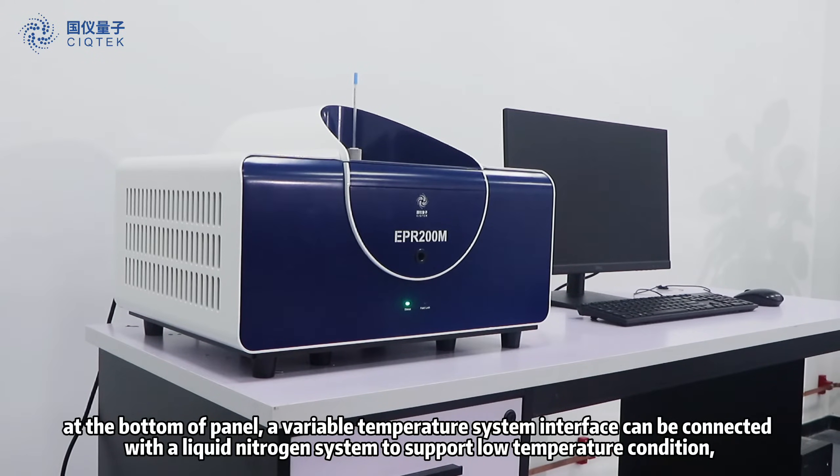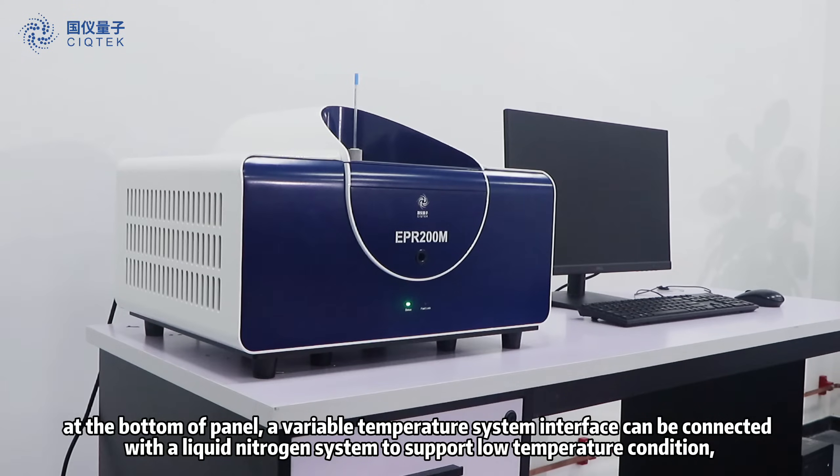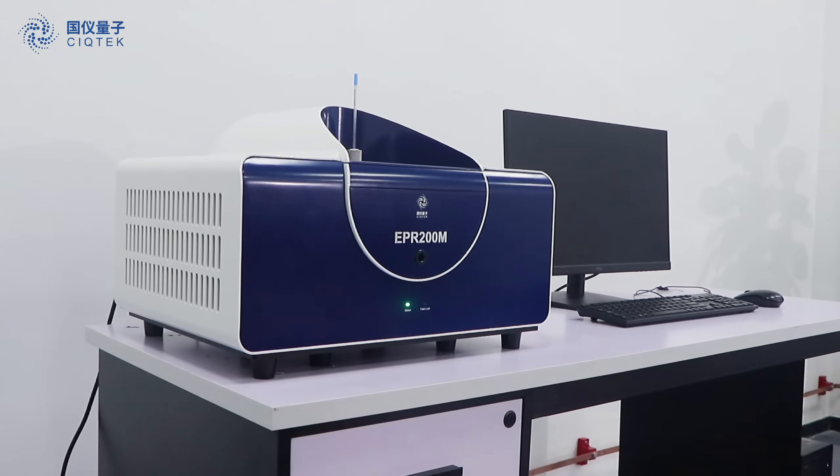At the bottom of the panel, a variable temperature system interface can be connected with a liquid nitrogen system to support low temperature conditions.